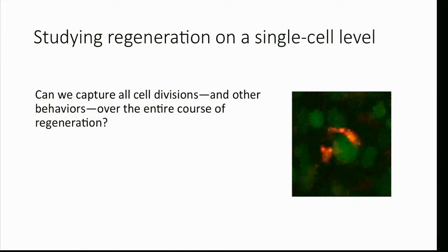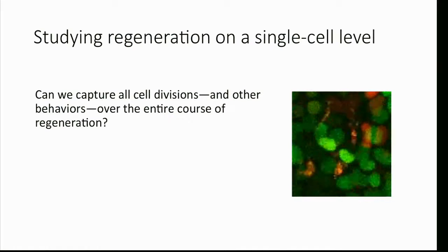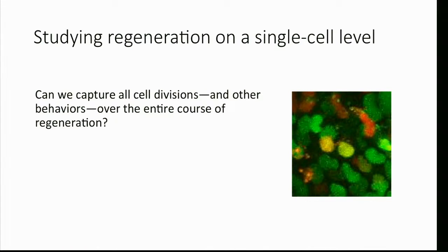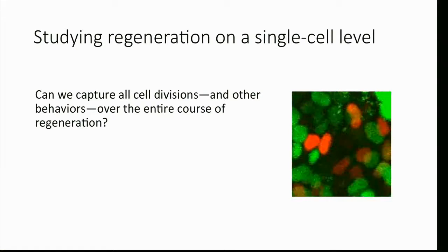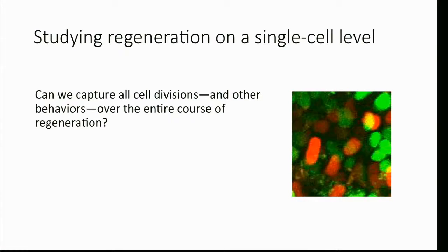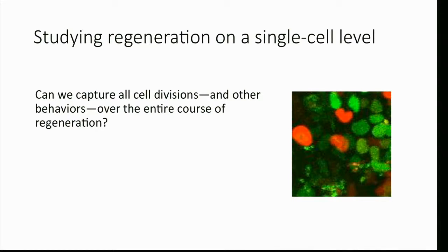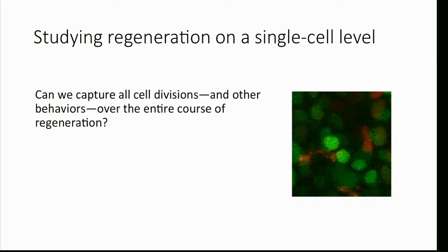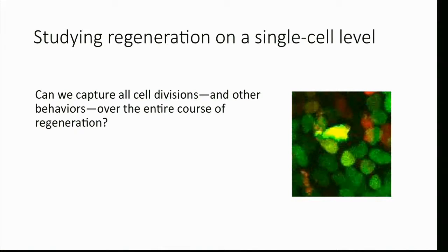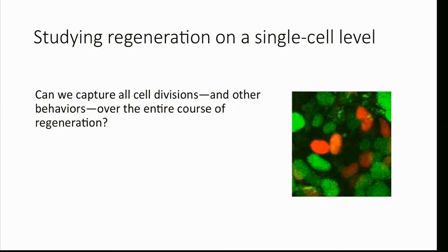But if we can achieve what I've proposed on this slide, that is capturing all the cell divisions as well as other cell behaviors, like characterizing planes of division, proliferation patterns, and stereotyped patterns of proliferation, then I think we can get at understanding some fundamental concepts about regeneration that we would not otherwise be able to understand if we were limited to a tissue level view of regeneration.